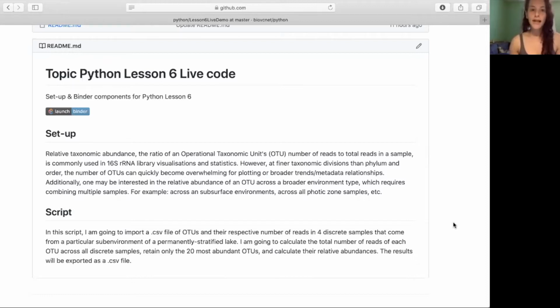So today I'm going to show a short code I put together which deals with a very common sorting and data cleanup operation people do to their OTU tables. So an OTU, or an operational taxonomic unit, if you don't know, that's just the taxonomic designation of some item in your table.